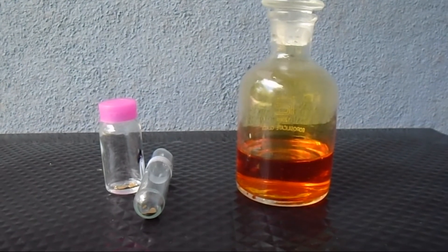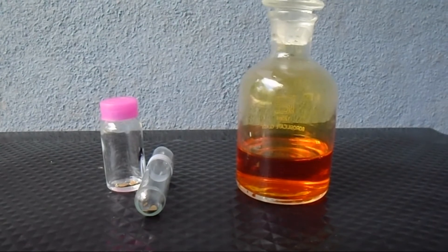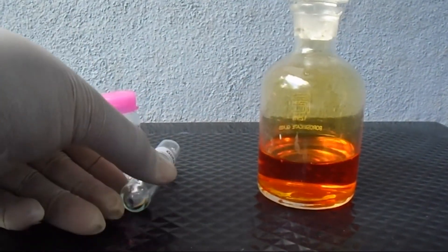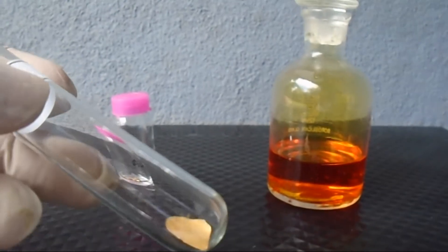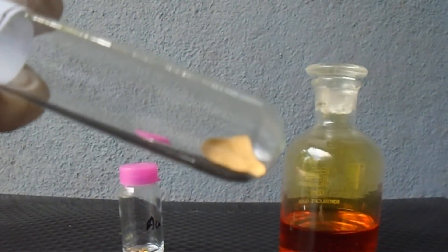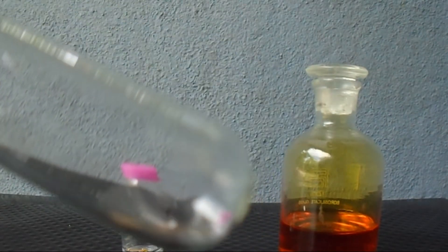In this video we are going to do an experiment with aqua regia solution. Here it is, our aqua regia solution, and I have a very expensive metal — here it is, gold. You can see here I have a piece of gold metal; this is 24 karat gold metal.